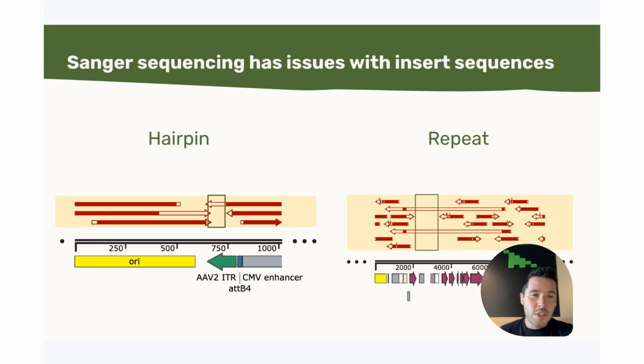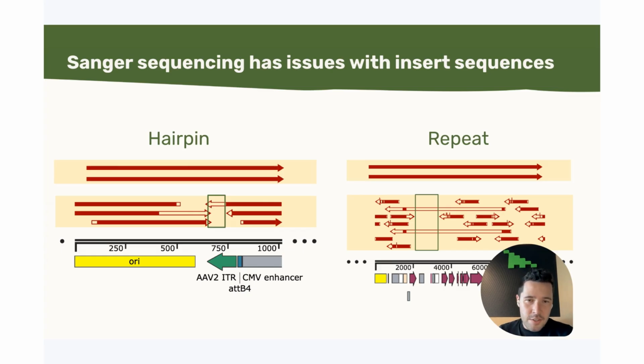And we see that a lot of the time this wasn't what was happening. It's because the QC test of Sanger isn't actually a very good QC test, right? What you see in the results doesn't reflect the truth, which is that only 10% of the plasmids were fully formed or properly formed as you expected. And if we look here, again, these are real reads, these are nanopore reads. You can see they read all the way through and they align the whole way along.